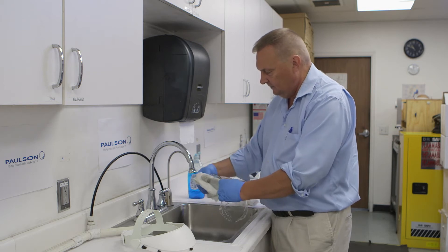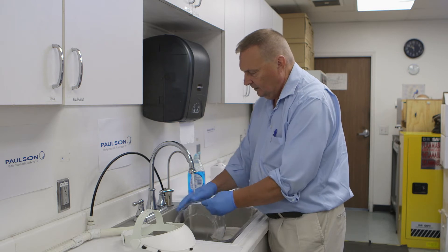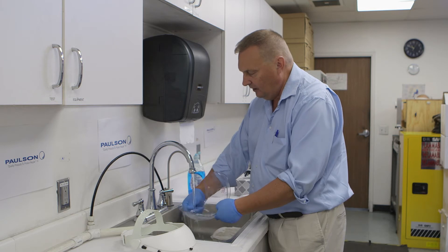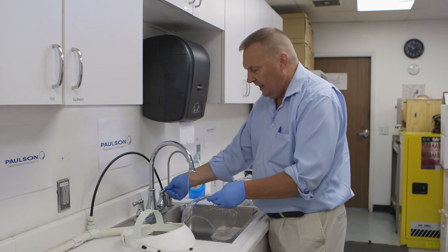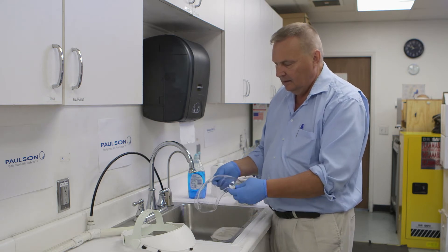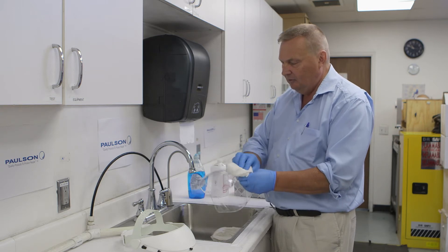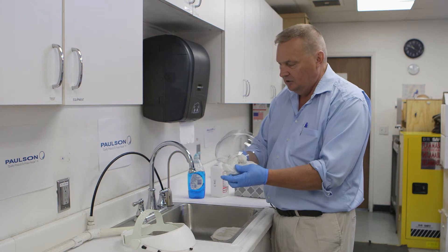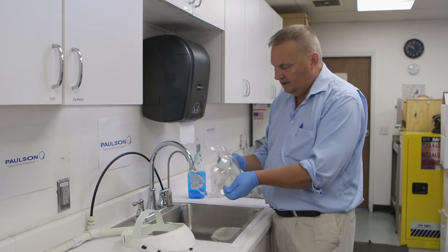Then rinse. These products are designed for 100 wash cycle rinsings, so don't be concerned about overdoing it. Pat dry — I say pat dry because I don't want to scratch the product in case there are any sharp abrasive particles — and set this to the side.